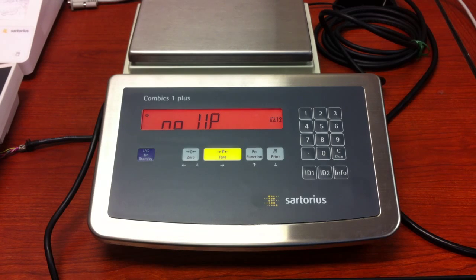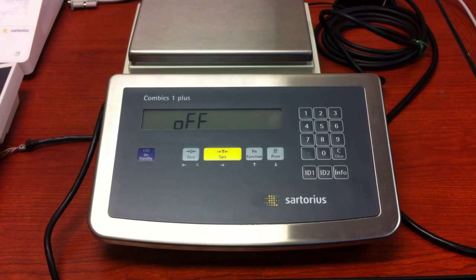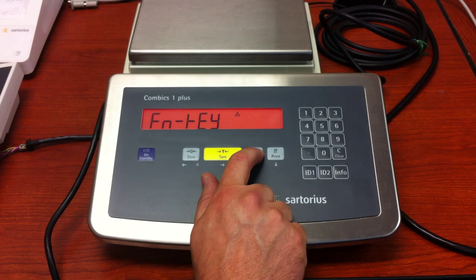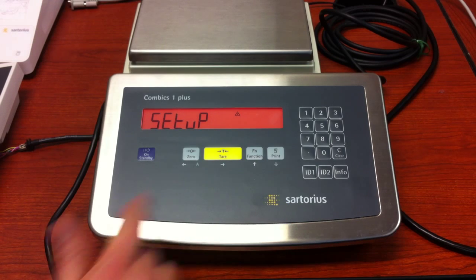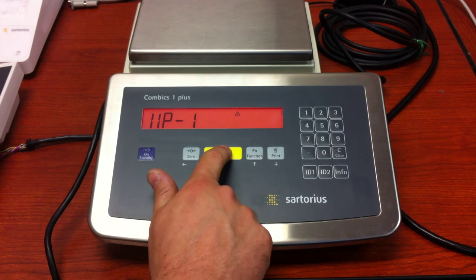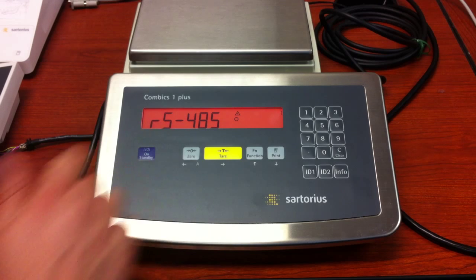The way we do that is by turning the unit off, turning it on, then press and release the tare key. Now press and release the function key until you see 'setup.' Press the tare key at WP1, press the tare key again, and you'll see that it is set up for RS-485.